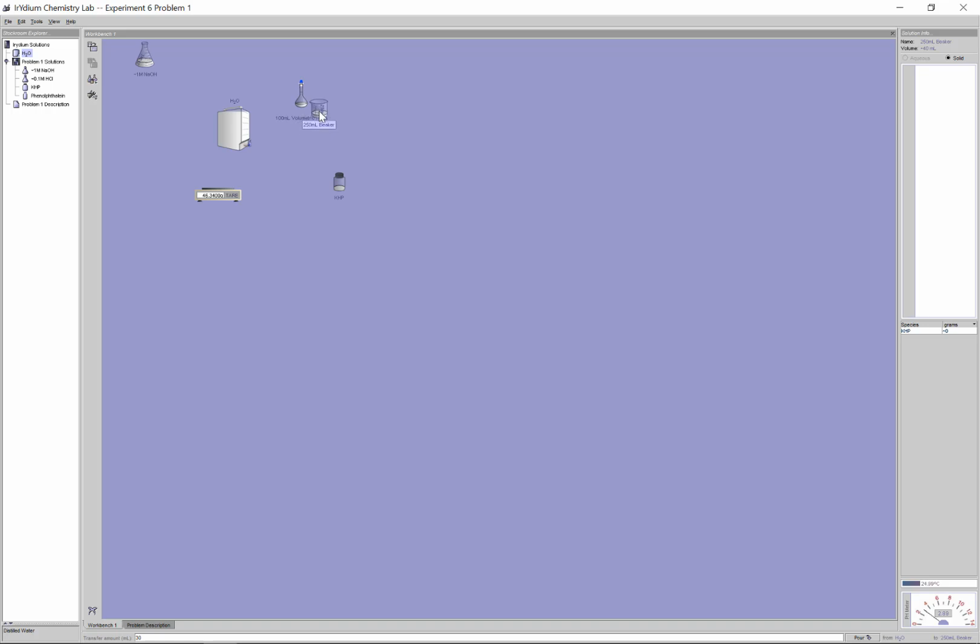You're going to try to wash in these extra amounts here, these rinsings, into this flask. Let me just pour it all in there. Still maybe a little bit left over, so maybe I'm just going to add a little more. So far I've added about 60 or so, so let's add another maybe 20. That should still be safe. You just want to pour in all the rinsings, transfer all the powder dissolved in here. I'm just going to pour in basically all of it there.